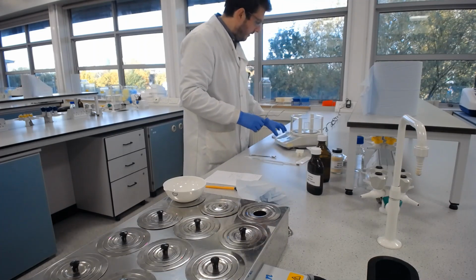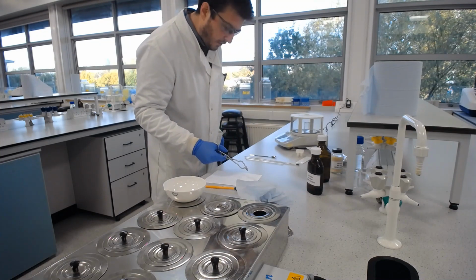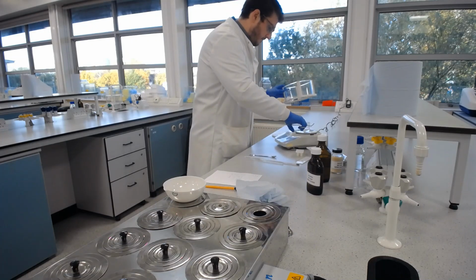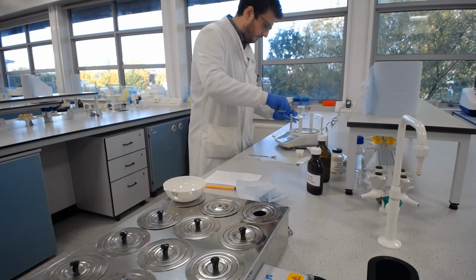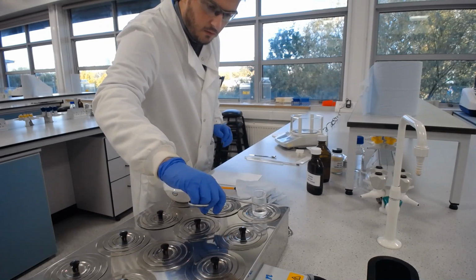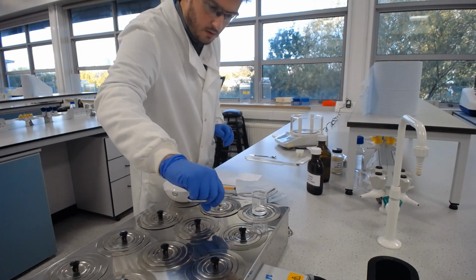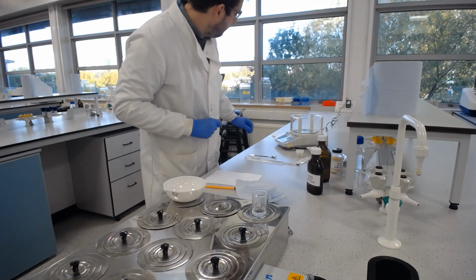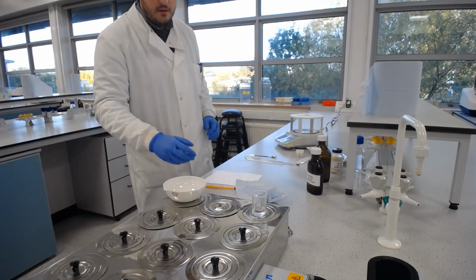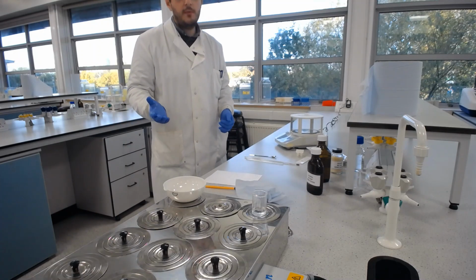I'm using the tongs here because this is probably quite warm. So that's at 25.16, so I've still got over 4 grams in there, so that's good. It might be fast enough. Get that back on the water bath. Okay, so I've got my 2 liquids, if you will, my water and my glycerol, warming up to 70 degrees.